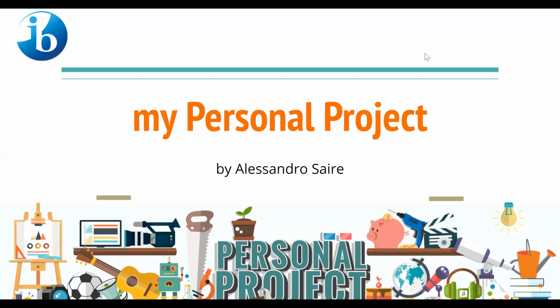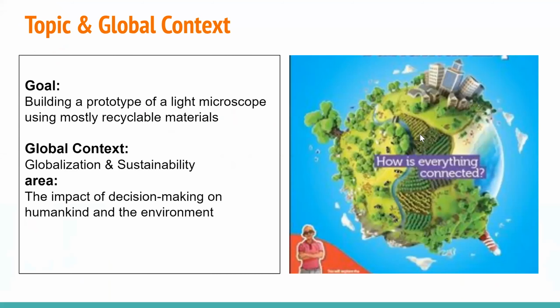I am Alessandro Saire, and for my personal project, I decided to build a light microscope using mostly recyclable materials. So my goal indeed was to build a prototype of a light microscope using as many and as much recyclable materials as I could.